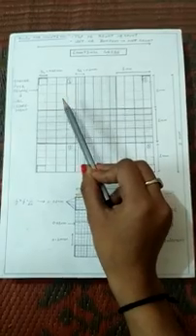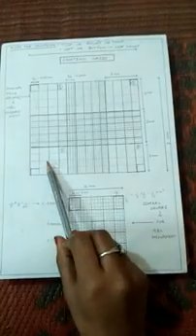So friends, this was all about how to measure or count the number of WBCs and RBCs. These four corner squares are used to measure or count the number of WBCs, and the central one is used to measure the number of RBCs in human blood.